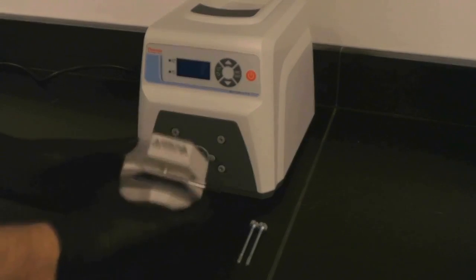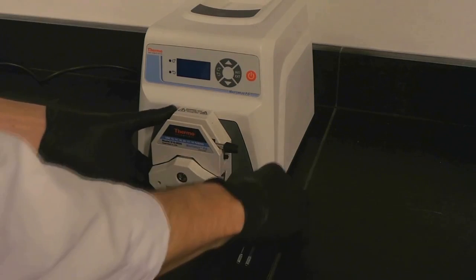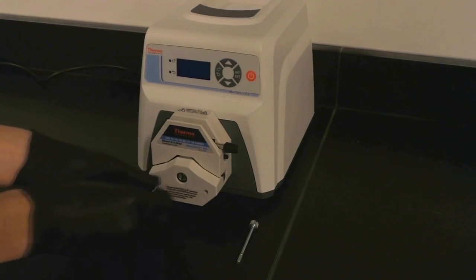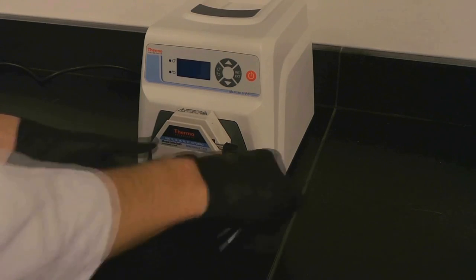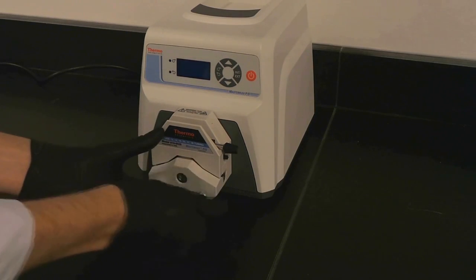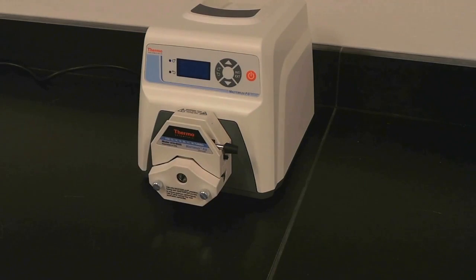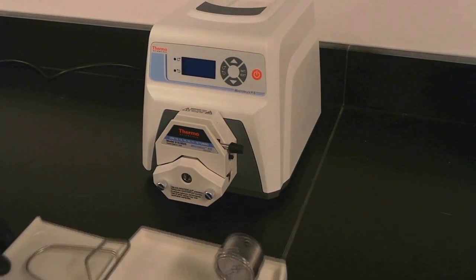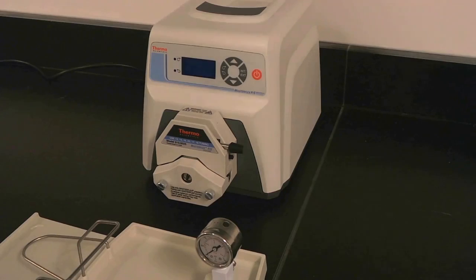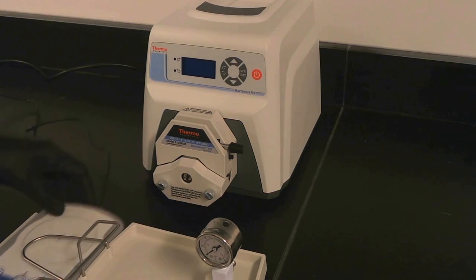To begin assembly, place the pump head onto the peristaltic pump and tighten the screws. Align the tray in front of the pump, and then insert the stir plate into the tray.